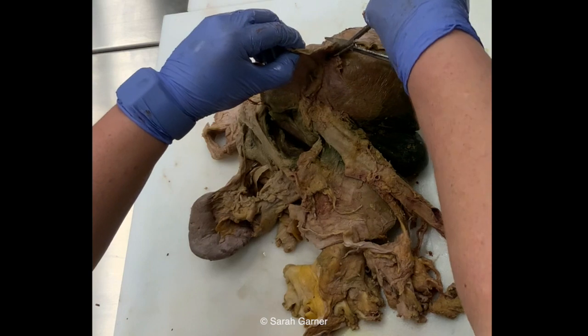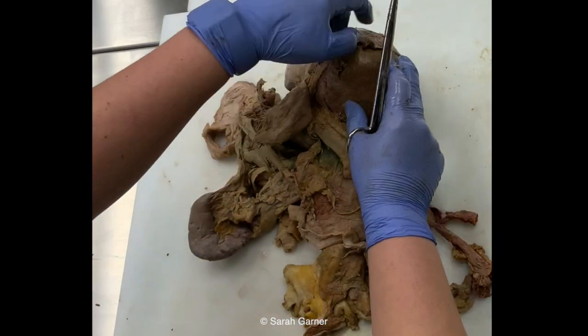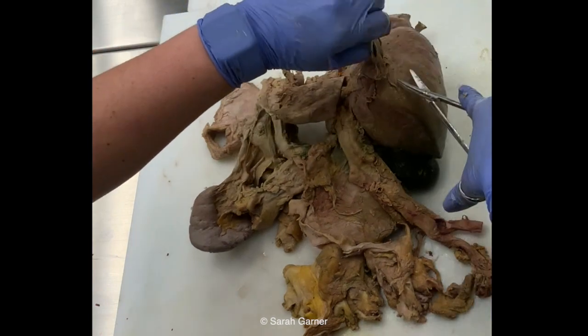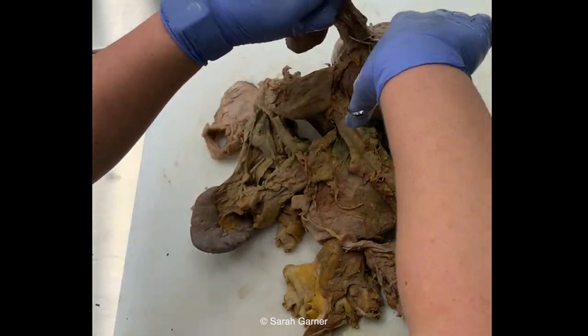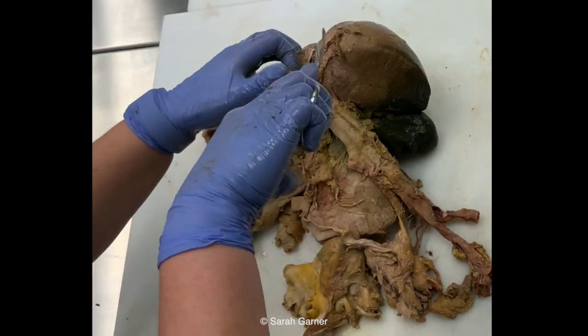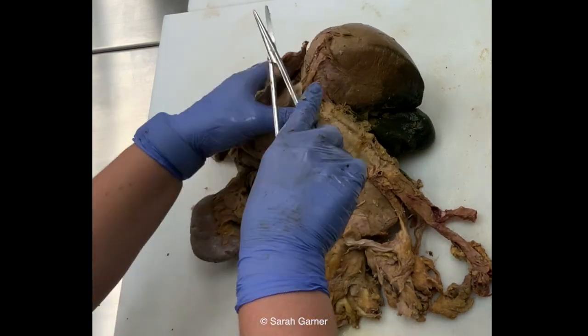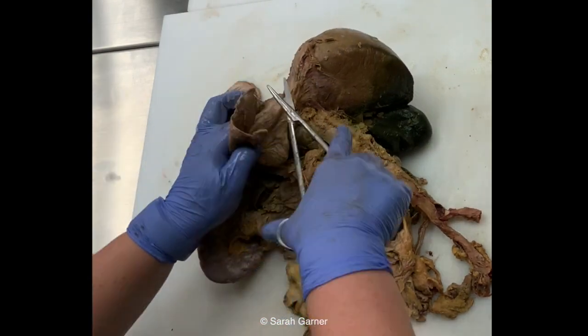So I'm going to go ahead and trim off the rest of this diaphragm here. Gosh, there's still so much on here. I'm missing a whole bunch here. This is usually a little bit easier to get off. I'm wondering if this is just because it's so fixed, but.